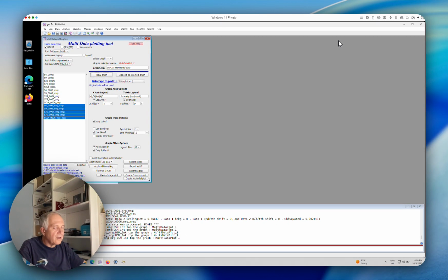And again, this procedure, the code currently available, can reduce data at least 10 years back, and it should be able to reduce data for both fly scanning on USAXS as well as step scanning on USAXS, and collected with any area detector we ever had for SAXS and WAXS.